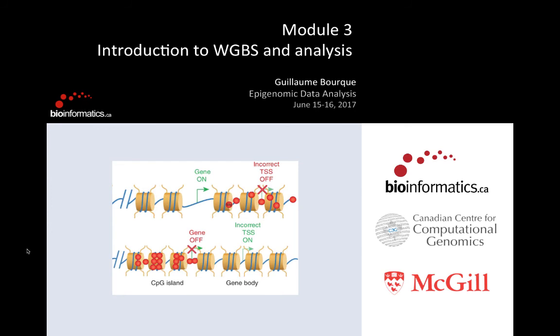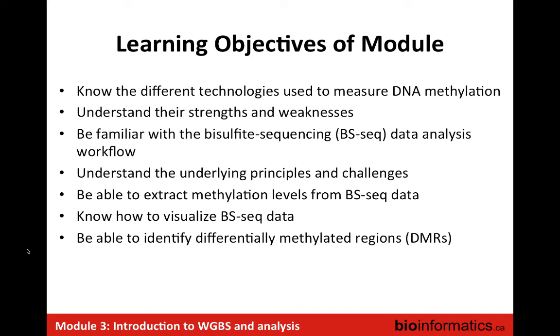Yesterday, you had an overview of ChIP-seq in particular with Martin and Misha. So today I'm going to start and cover methylation and in particular whole genome bisulfite sequencing. We'll see this figure again, and I'll explain more what this figure represents. We have plenty of time in this morning session, so feel free to ask questions along the way.